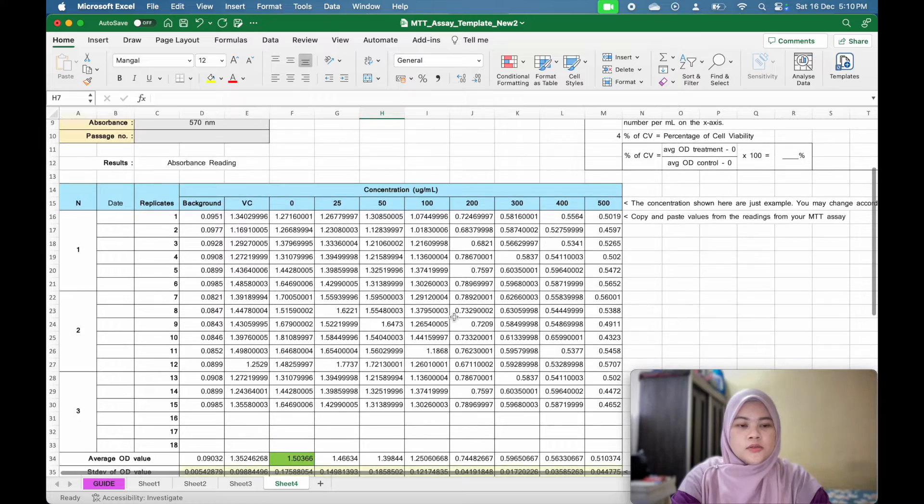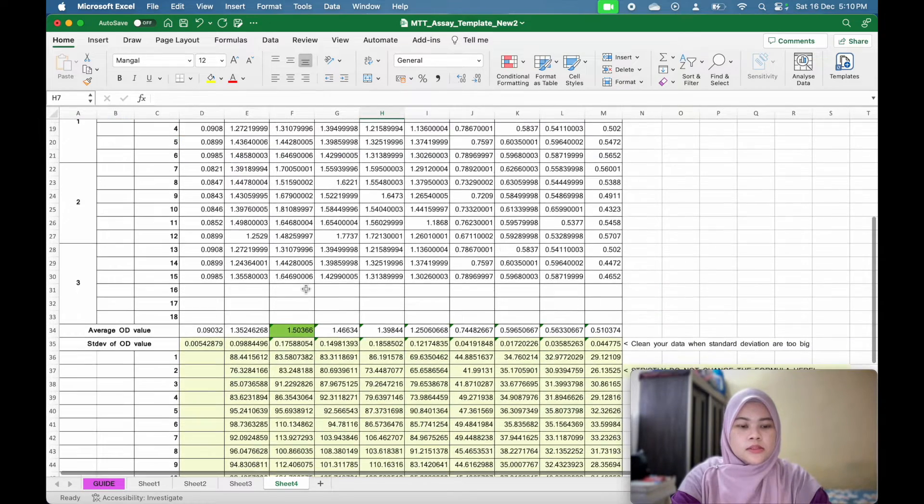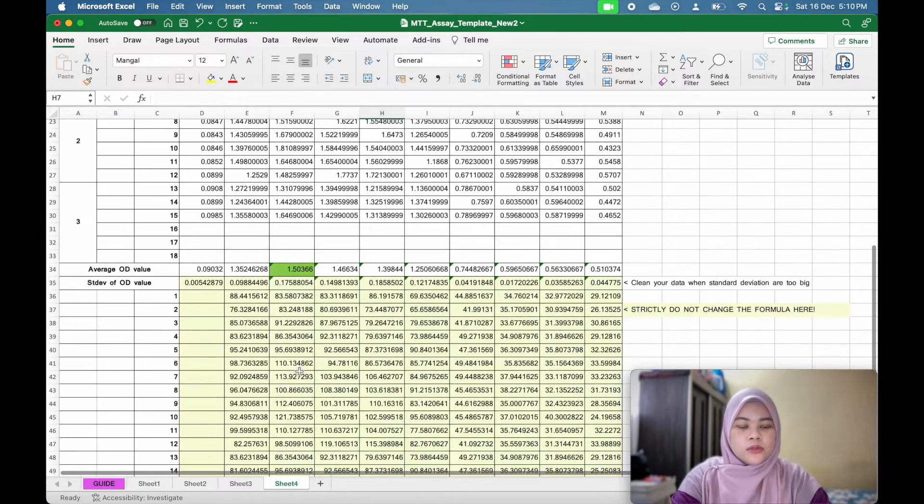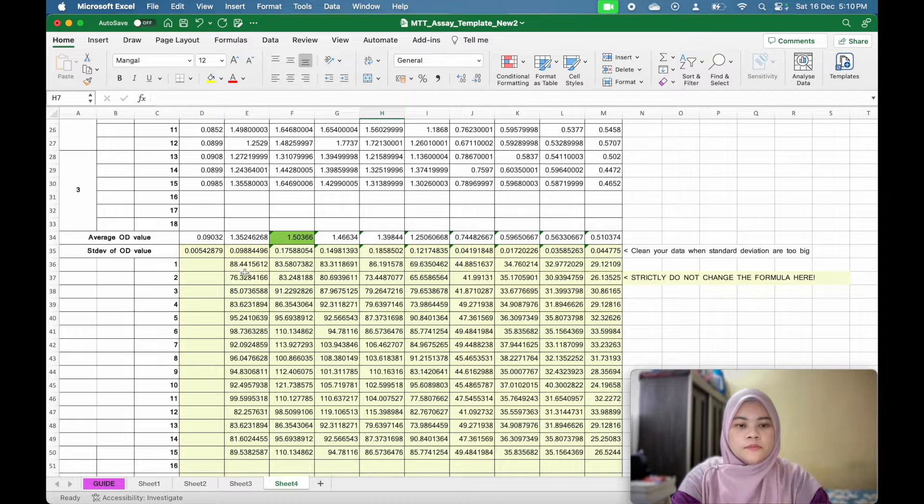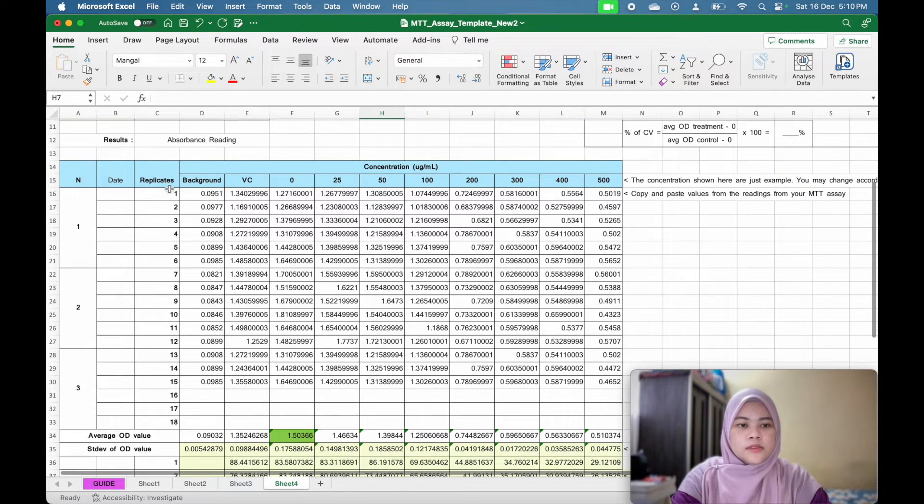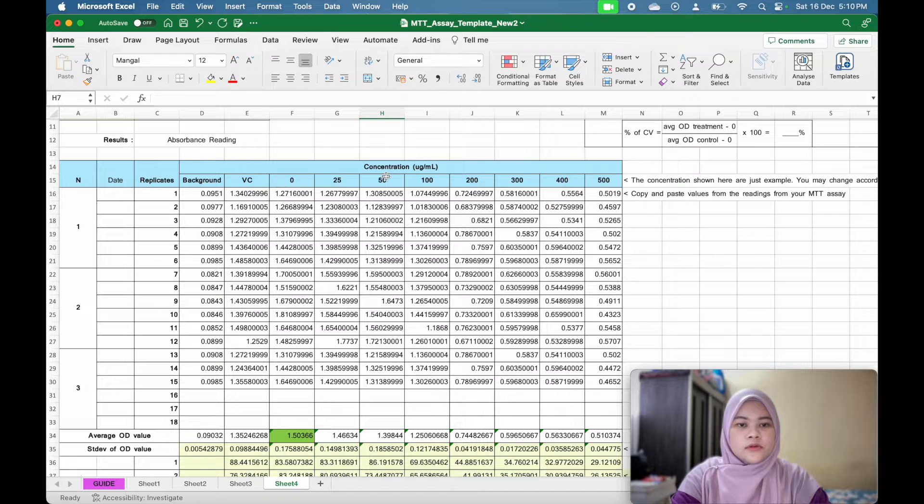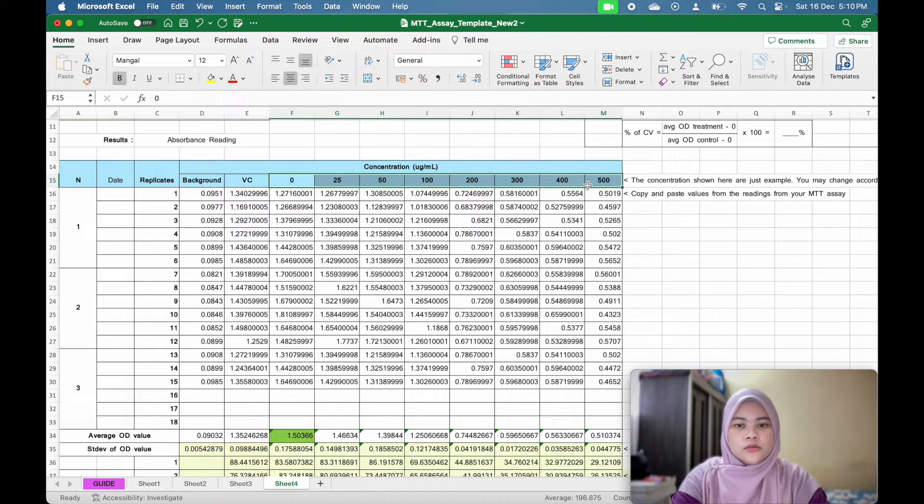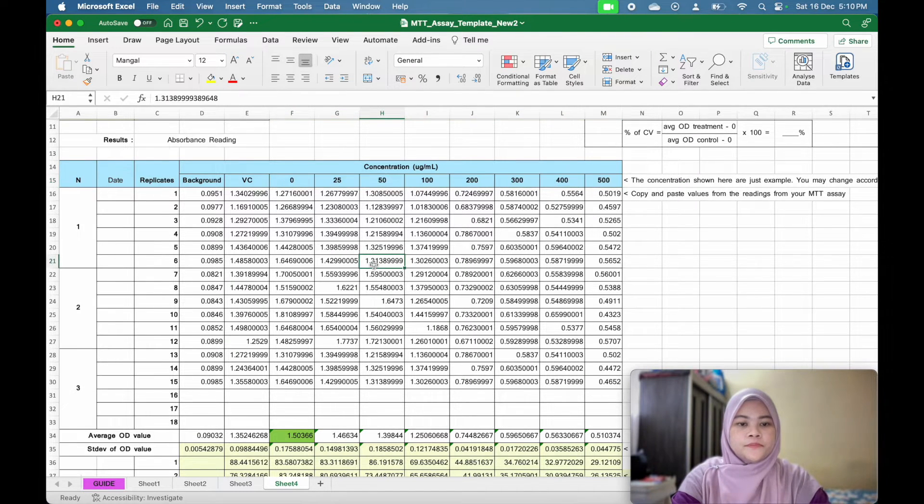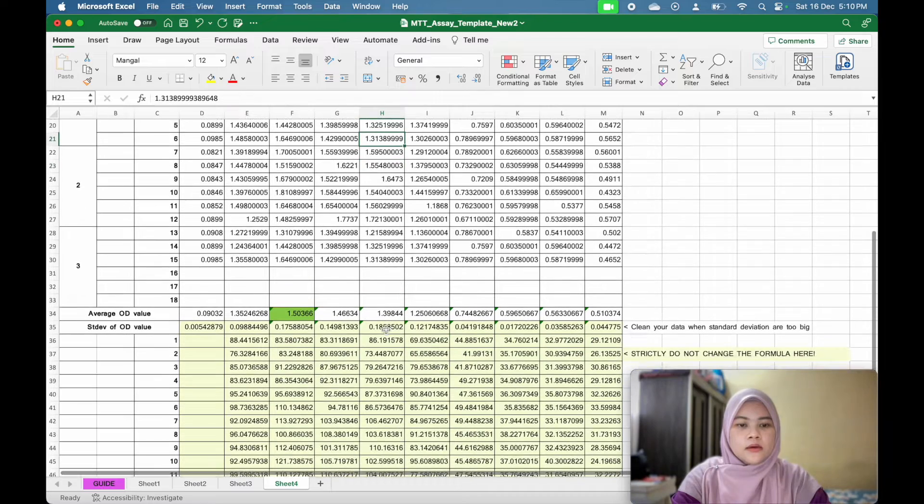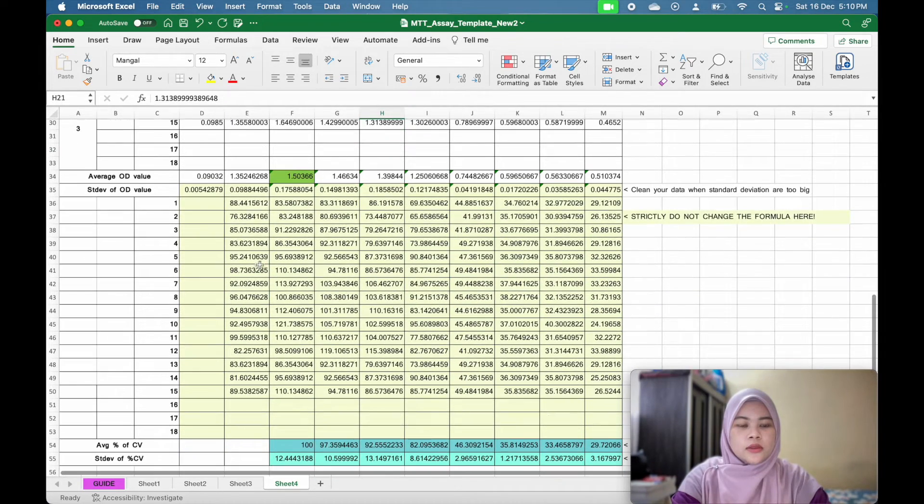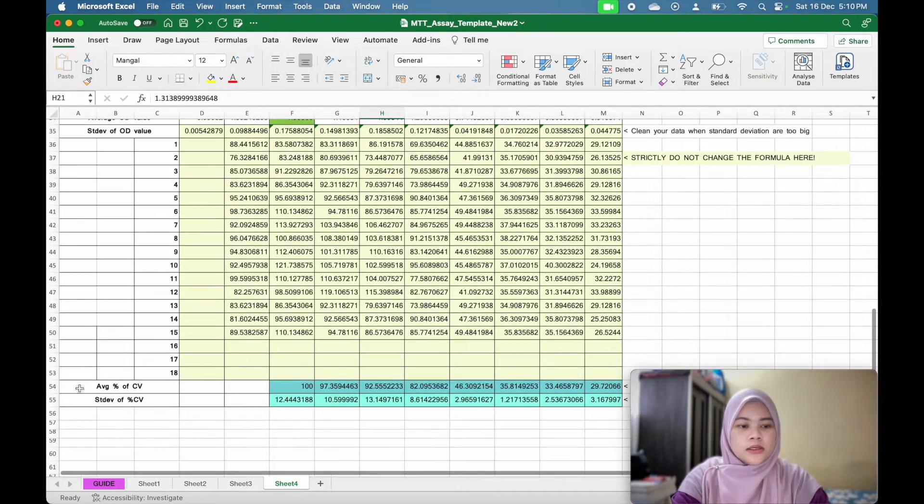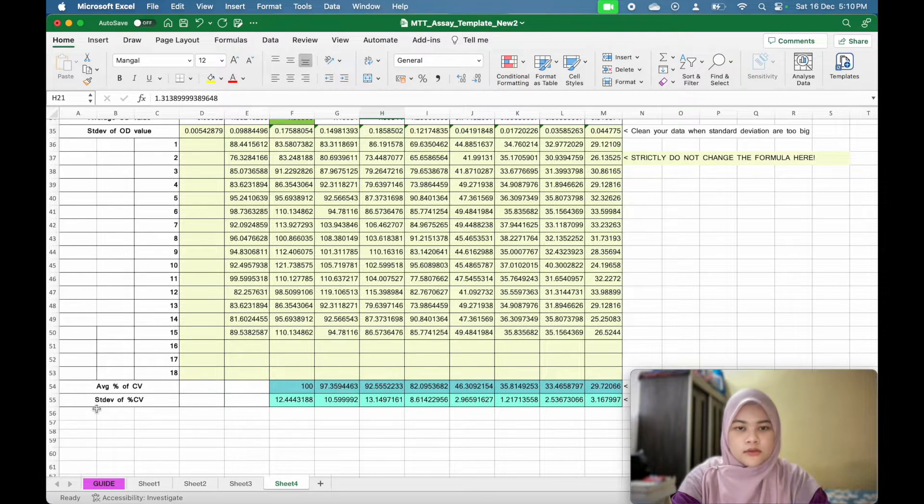You can use this template where I already insert the formula of percentage of cell viability. You can just copy and paste the value of your replicates for different concentration. You can also edit the concentration you use here and once you paste the value, the results will come up here and calculate the average of your percentage of cell viability as well as standard deviation.